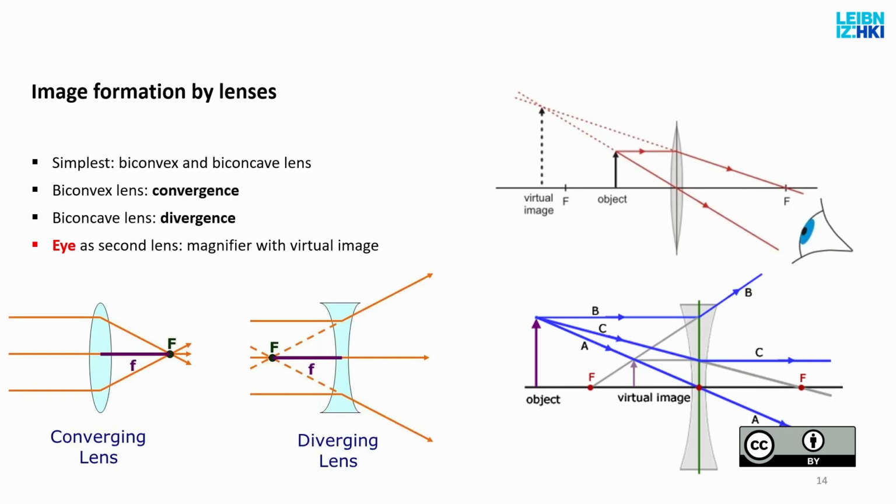a product underneath it and read the small print. Why is that? It is because these lenses behave in a certain way when they allow you to form an image. Namely, if you have a double convex lens, the one that we just quickly talked about, and you set it up so that it's perpendicular to the horizontal line, and you place an object into the light path, then there are certain laws with which the image will be formed.